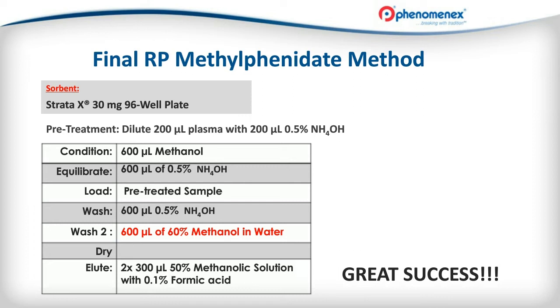It's kind of what's important to you, but at the same time, by eluting off with only 50% methanol, we're going to bring a lot less of the junk back off of the cartridge that we would have otherwise brought off if we would have just eluted with 100% methanol in formic acid, aka the 50-ish% matrix effect that I showed from the previous slide.